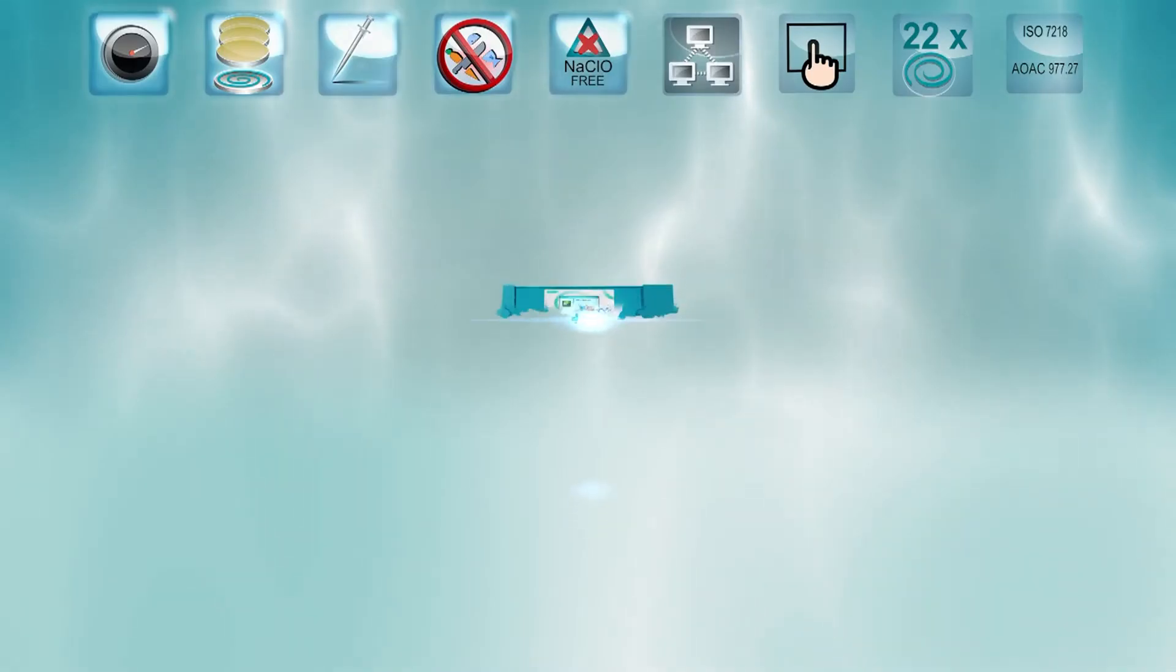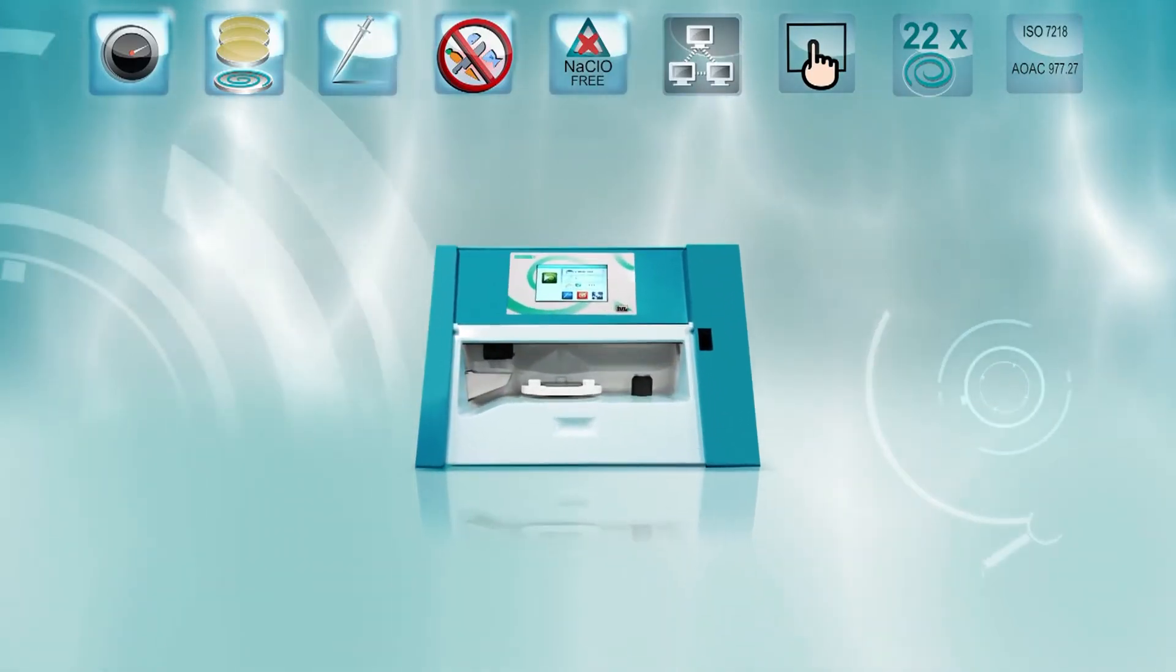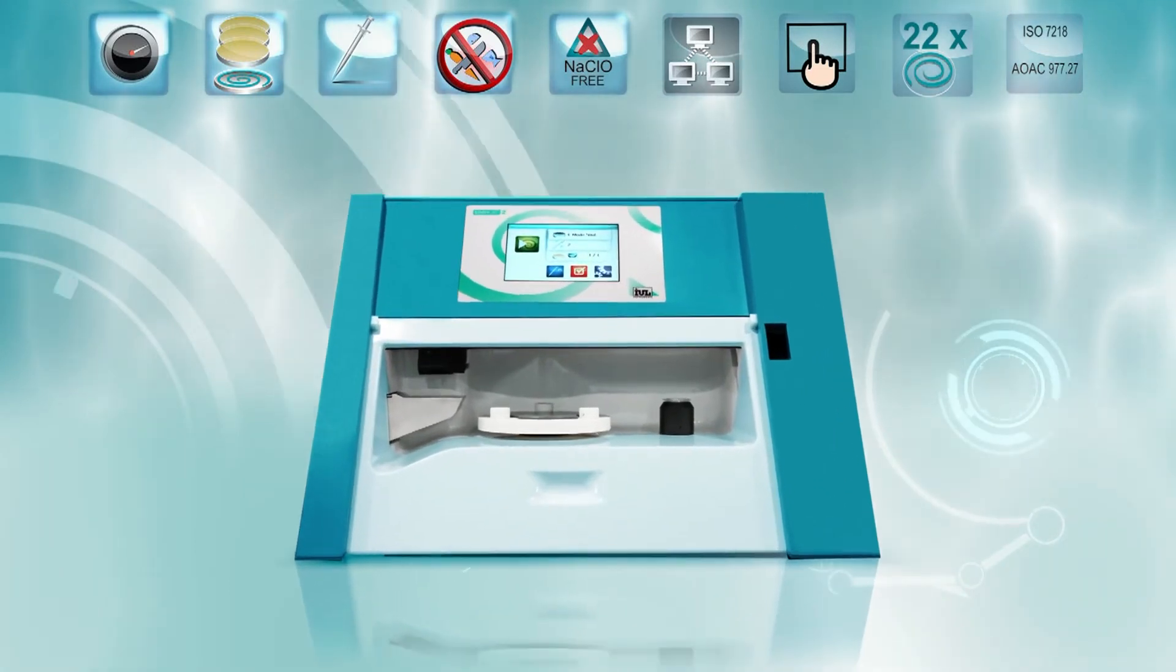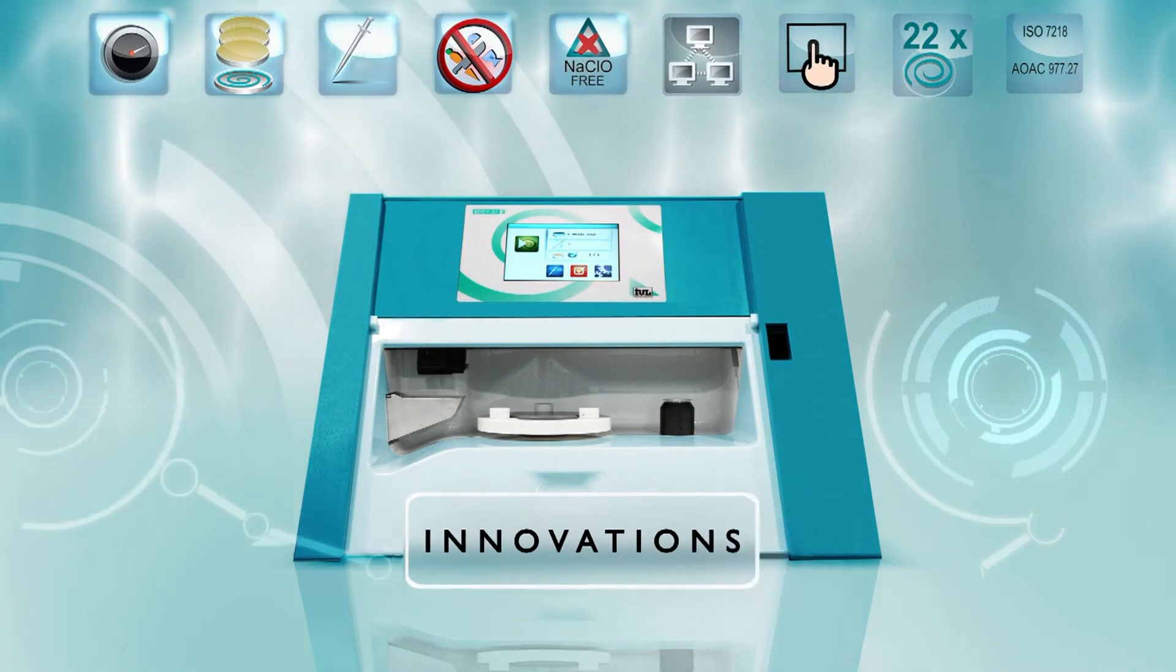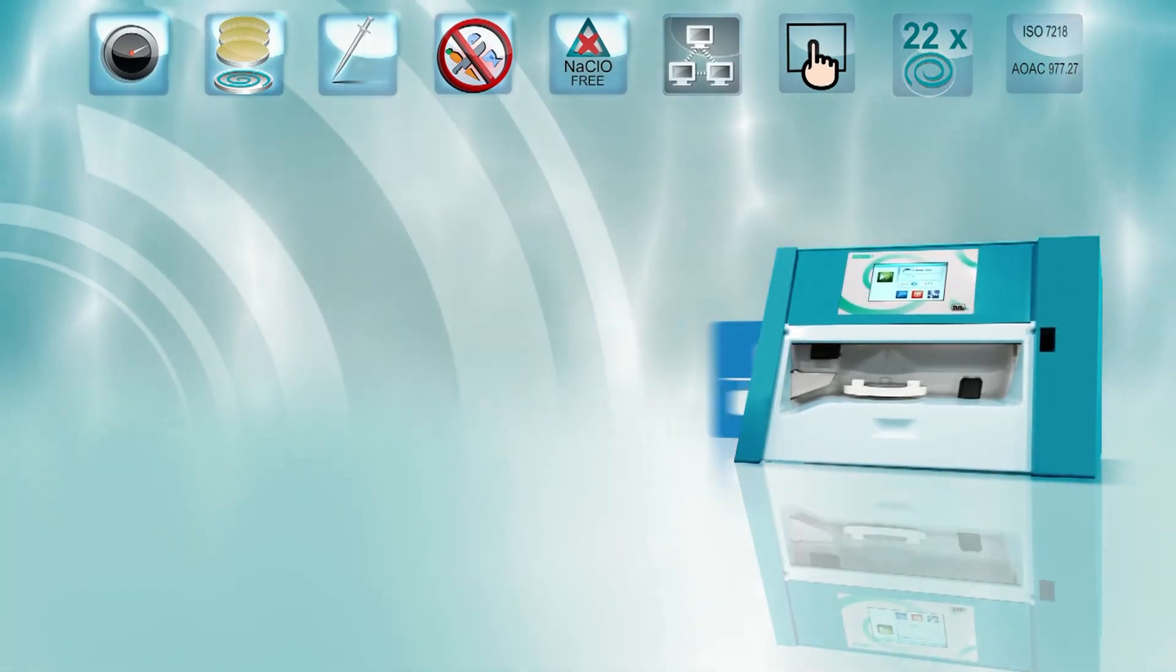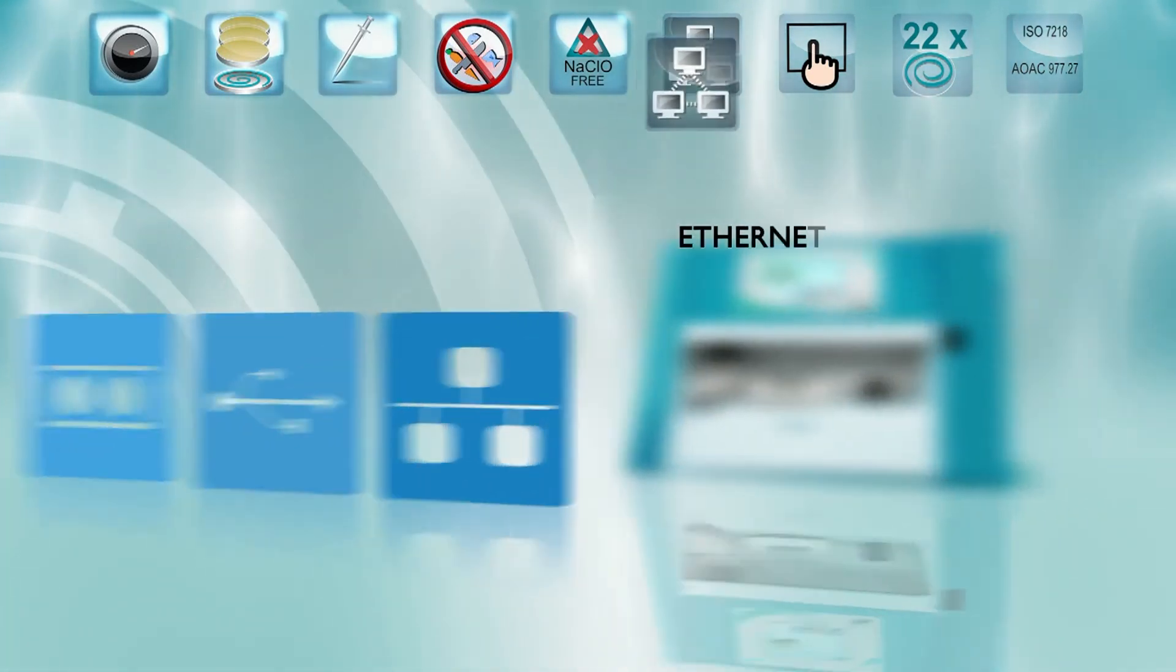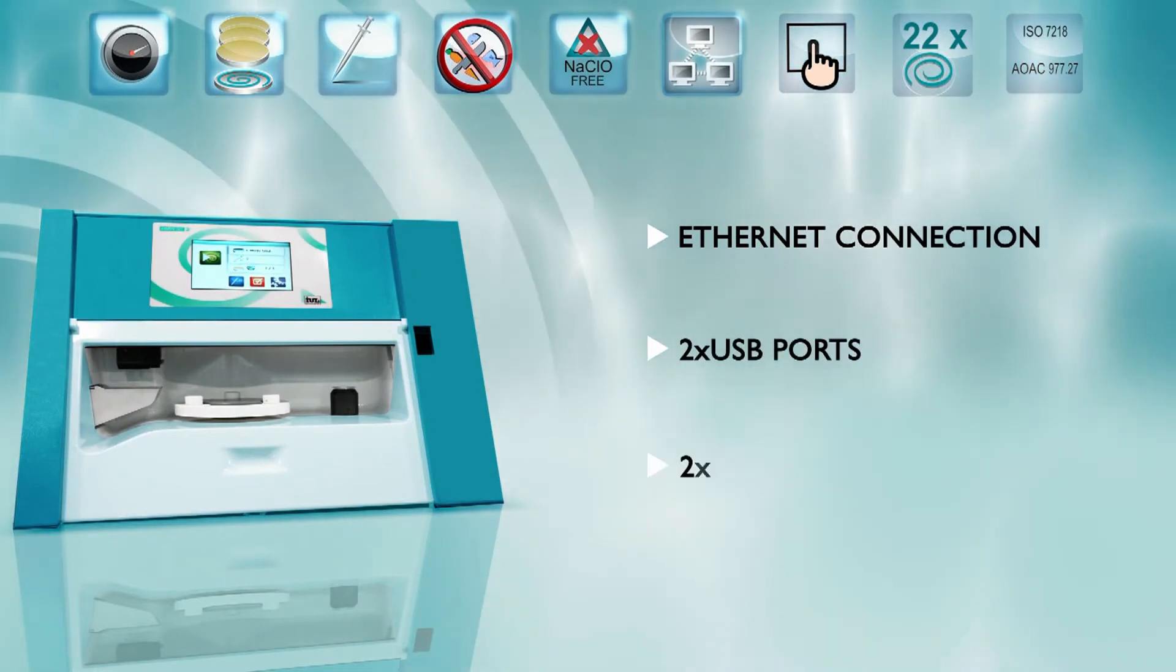EDIJED2 is an unmatched spiral plater that pushes the outstanding standards of the first EDIJED even further by adding trendsetting innovations to spiral plating. Its cutting-edge connectivity features an Ethernet connection, two USB ports, and two RS-232 ports.